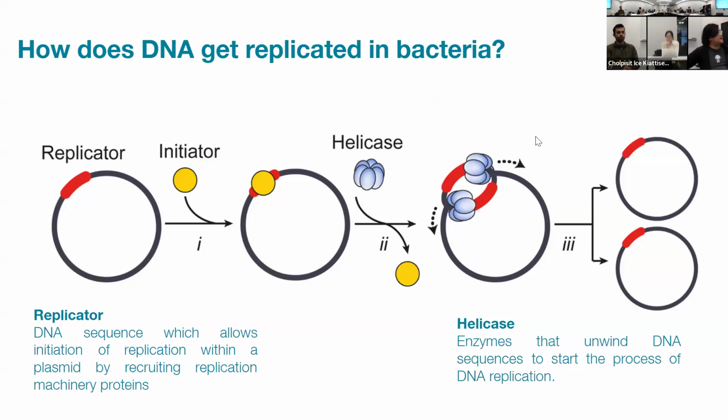And this is a simple way of how the bacteria replicate the DNA. It's just going to start at the origin and double them every time they grow. So at the end of the day, you start with one bacterial cell, put it into a tube, and at the end of the day, you may have billions of them. You actually clone the DNA from one copy to billions of copies. And that's why we call it molecular cloning, because we clone the DNA part.